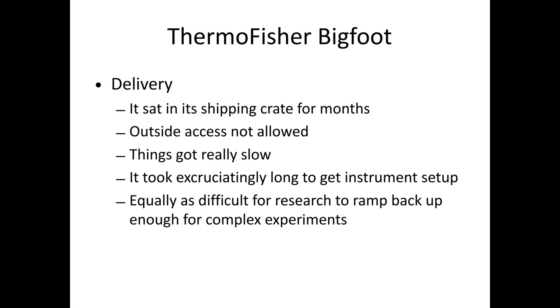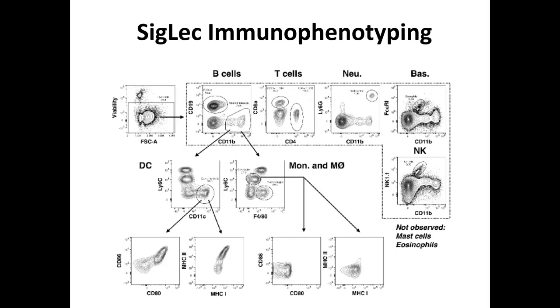And it was our buddy Landon Edgar, who's now at the University of Toronto, and he had a great model. He actually came from a mass cytometry background, doing high dimensional stuff and making all the reagents. And he came over to Scripps having done no flow, and he was just brilliant, picked up on it right away. And his model was looking at carbohydrates on different phenotypes. So it was a great model because you could use classic immunophenotyping combined with also co-expression of these different carbohydrates, and it all correlated out really well in this high dimensional stuff.